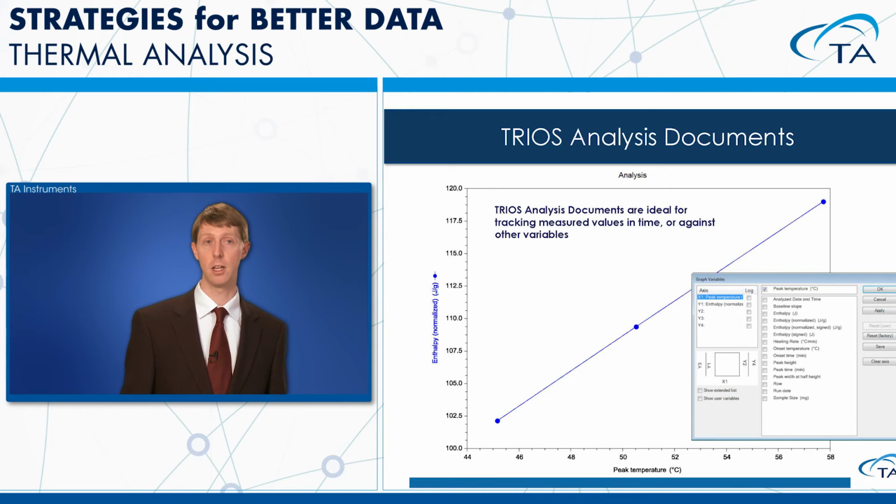But the other nice thing about it is that you have the same plotting and formatting abilities that you have within all of your other data sets that you've collected in Trios. So, being able to change your scaling, to zoom in, to tabulate results, to see trending type data, you can do all within Trios now. So you don't have to rely on Excel, rely on the plotting and graphing components of Excel. You can do all of that functionality within Trios. And again, you have full functionality of variables and scalars and so forth. So there's much more power to these analysis documents if you're really tabulating a lot of results and you want to be able to generate reports, present these to an outside customer.